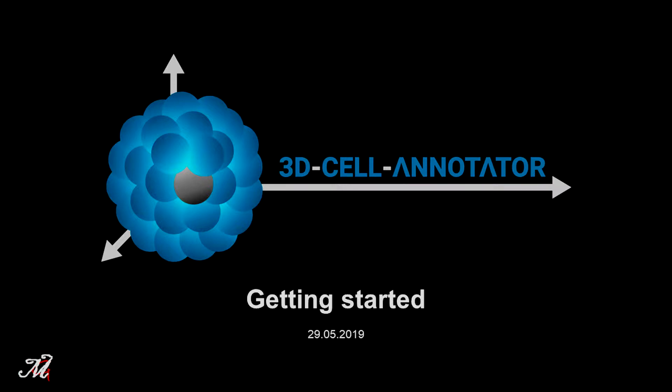Welcome. This is the first video tutorial on 3D Cell Annotator. I will show you how it works and what its basic features are. Before running 3D Cell Annotator, please read the help documentation file provided with the software.